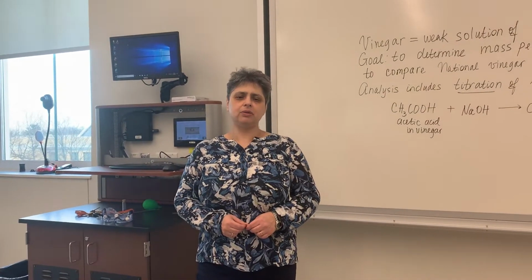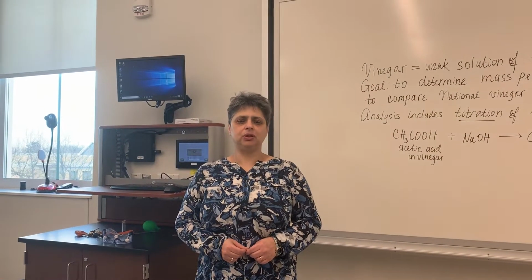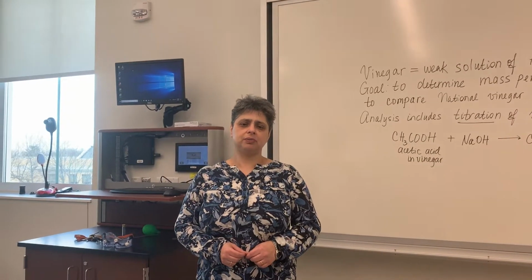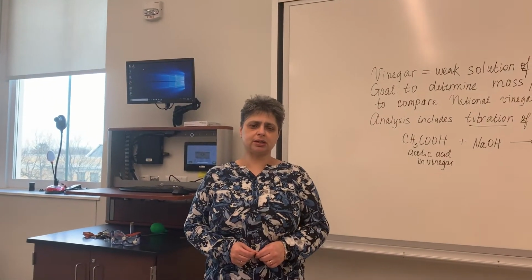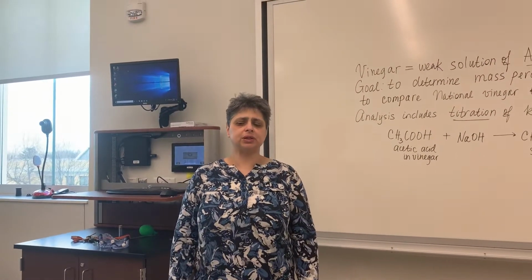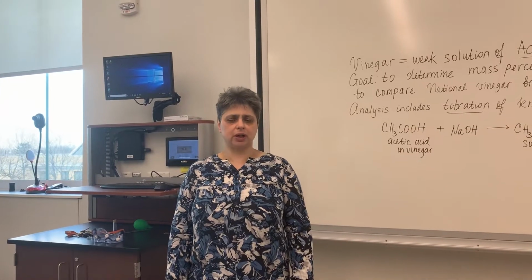Hello everyone, I'd like to welcome you to our general chemistry lab once again. This time the topic of our discussion is the continuation of the titration experiment. Specifically, we're talking about vinegar analysis.